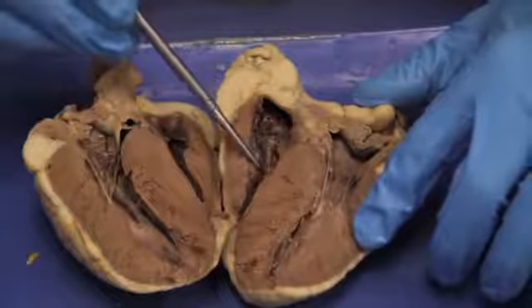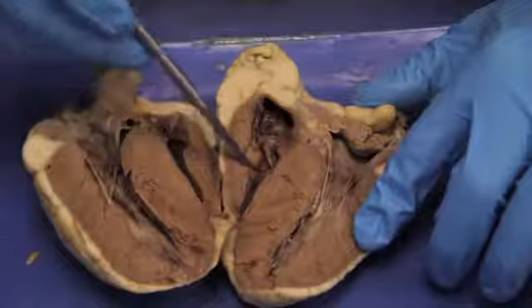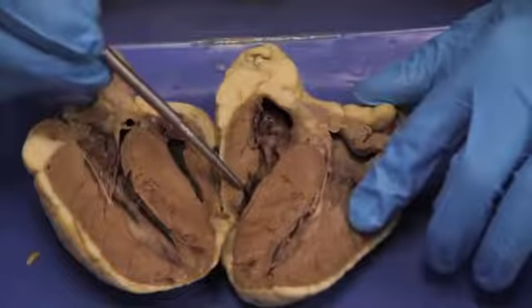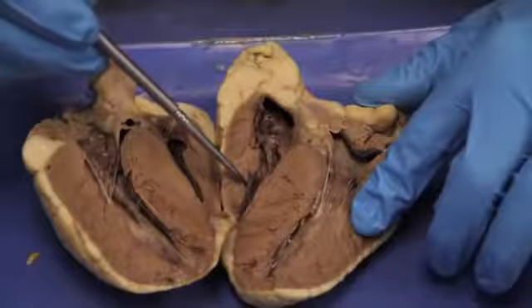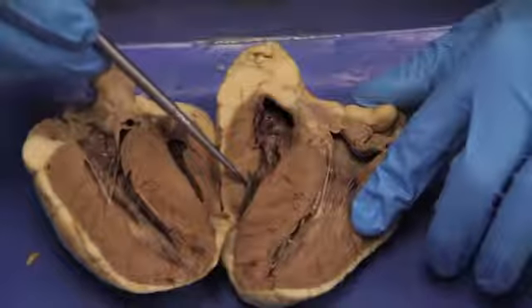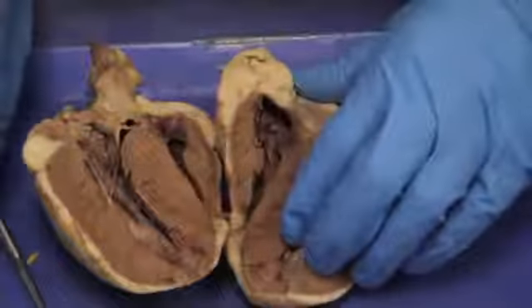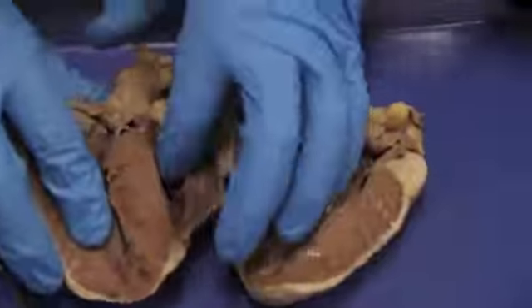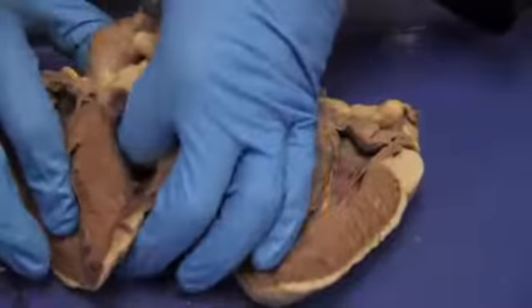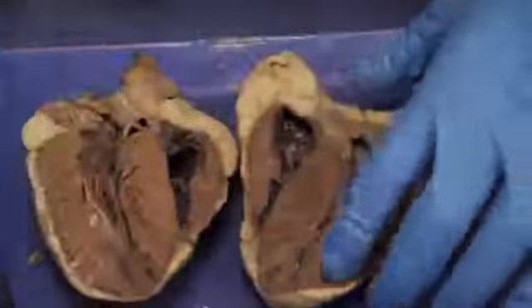And it's held in place by the papillary muscles and chordae tendineae. Now we're ejected out into the pulmonary artery through the pulmonary semilunar valve. And we can dig for that with our fingers, making sure that we know where we're going. So, find your fingers, you know where your pulmonary artery is.